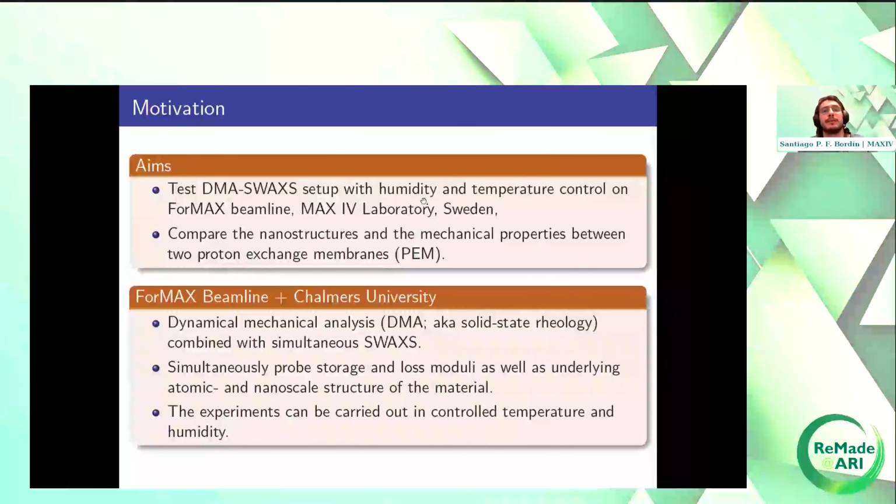So the motivation for this study is basically two. First, we wanted to test a new setup that is a combination of dynamic mechanical analysis with small and wide angle X-ray scattering, with the possibility to control the humidity and the temperature. And for sure, we wanted to compare the nanostructure and the mechanical properties between two proton exchange membranes.